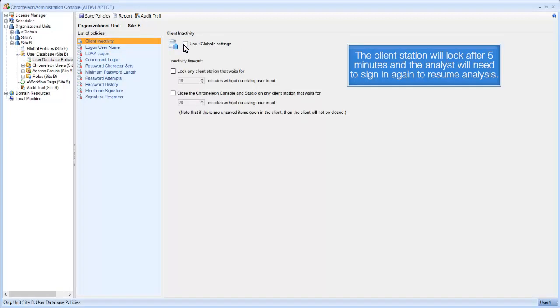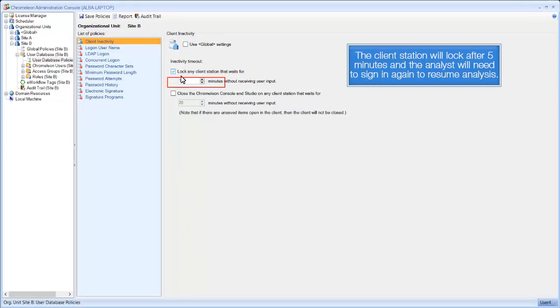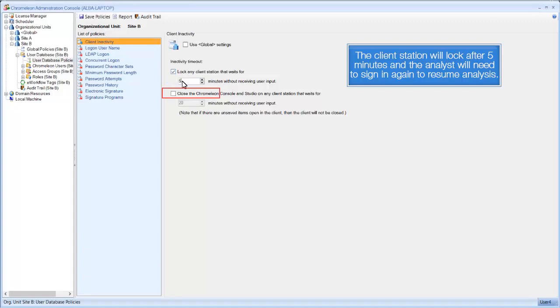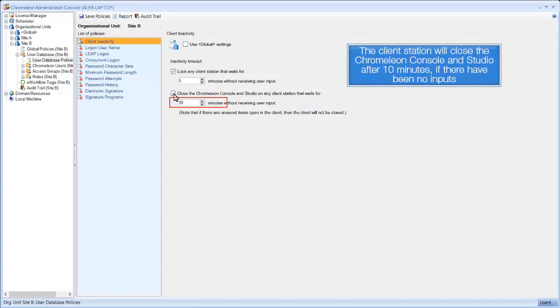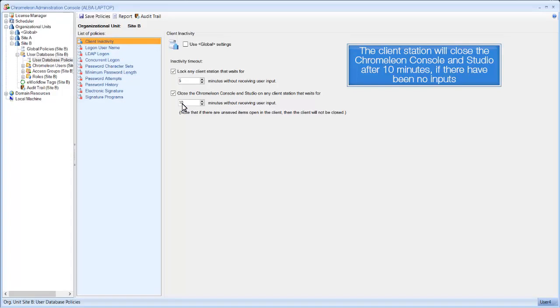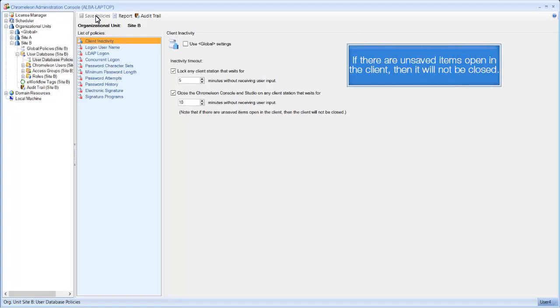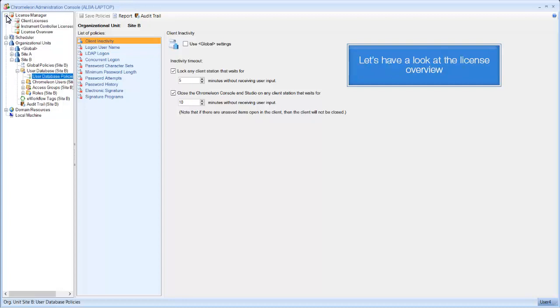The client station will lock after 5 minutes and the analyst will need to sign in again to resume analysis. The client station will close the Chromeleon console and studio after 10 minutes if there have been no inputs. If there are unsaved items open in the client, then it will not be closed.